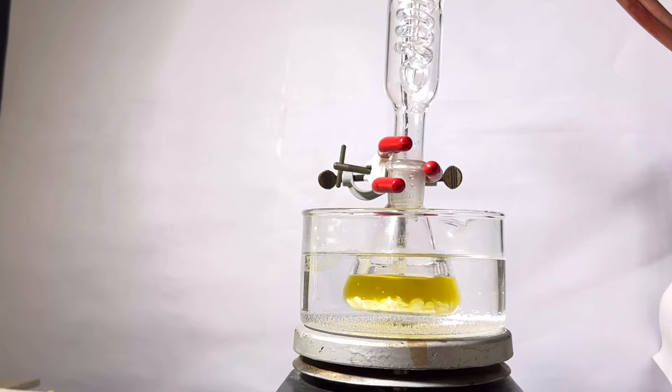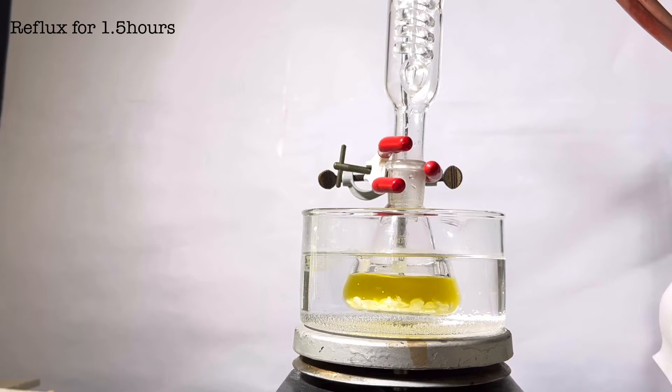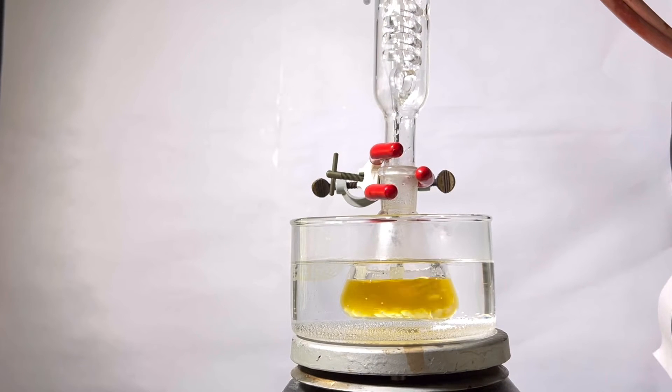Now a dimroth condenser was attached on top of the flask and the flask was placed in a boiling water bath. Cold water was circulated through the condenser and the reaction mixture was refluxed for 1.5 hours.